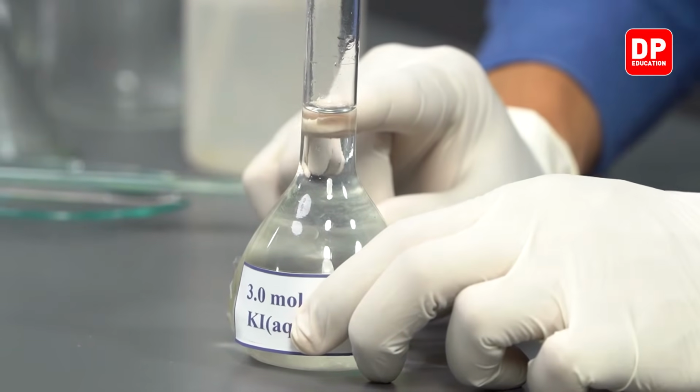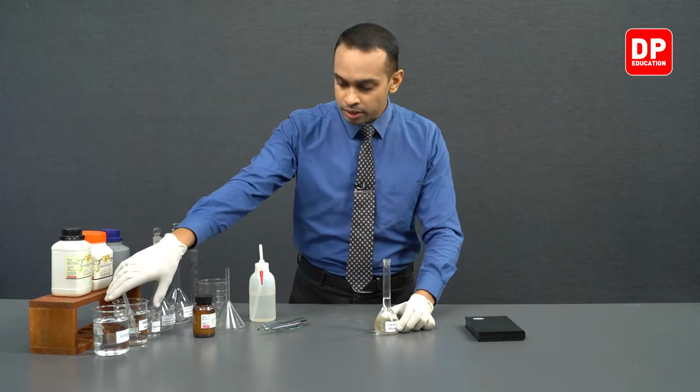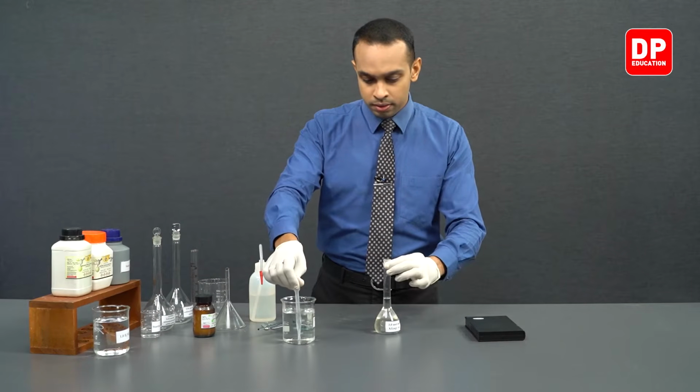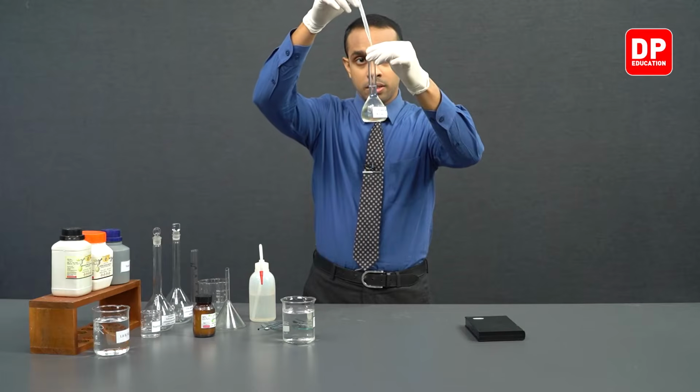Now by this point we can see we are very close to the calibration mark. Our water level is over here, calibration mark is all the way over here. So we will slowly start adding distilled water until the meniscus aligns with the calibration mark.